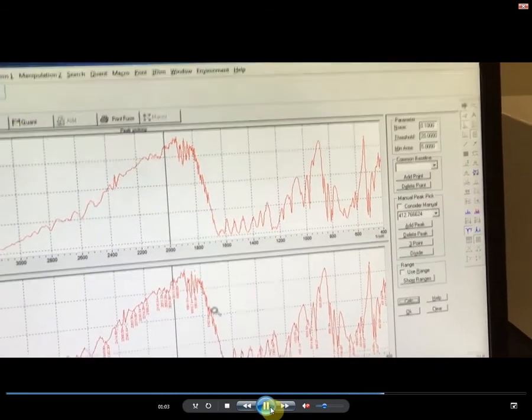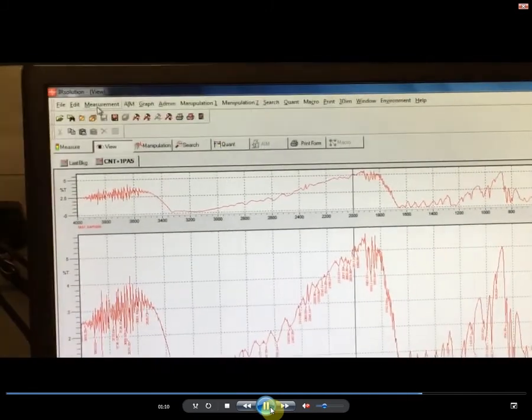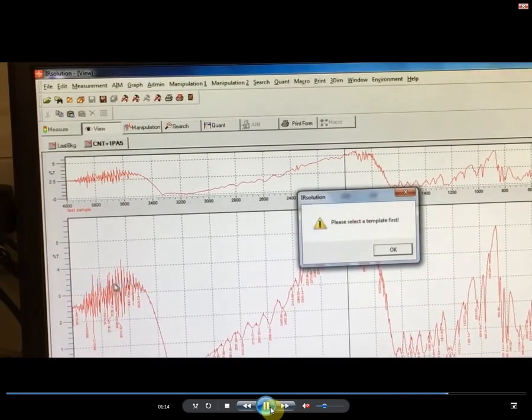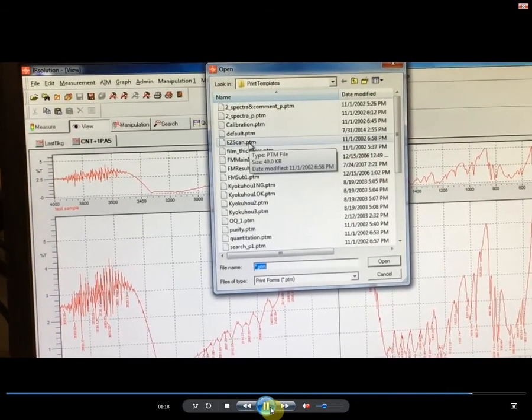Next, click Calculate, and you should see the wave number of all the peaks in the spectrum. Click OK. To print your results, click Print and select Easy Scan, Template for printing. Collect your printout.